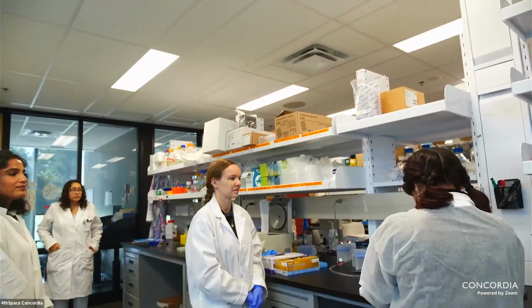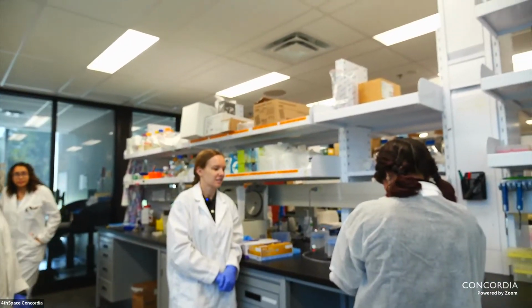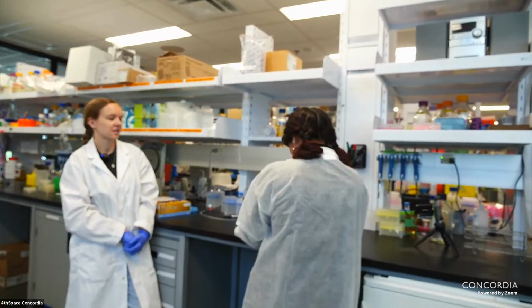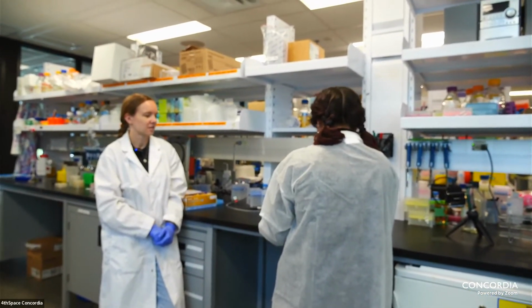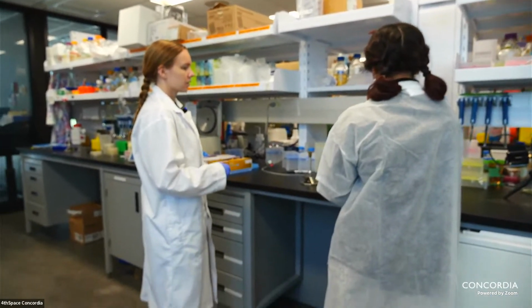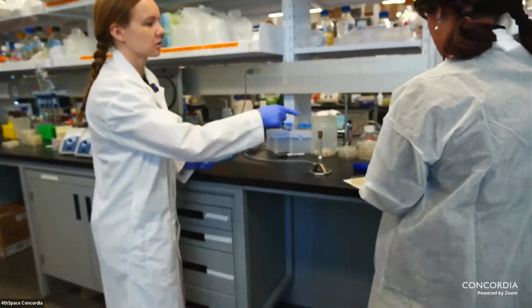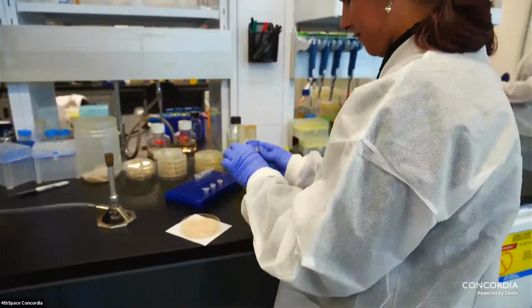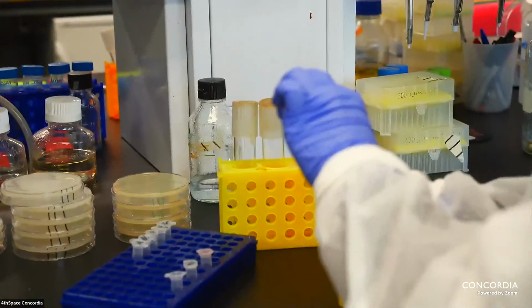How's it going? Good. Nice. That's more like an experimental, like. Nice. That's cool. Yeah, so you can see on the toothpicks, it's just that small yellow one there. So here I can show you an example if you want.